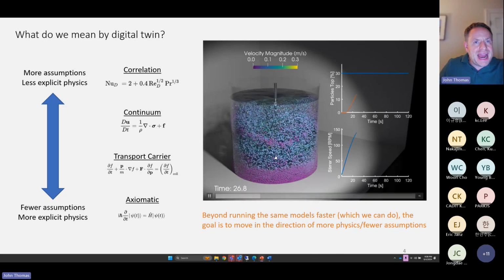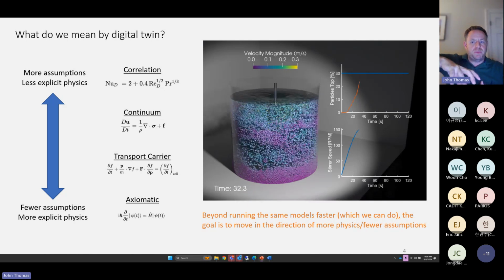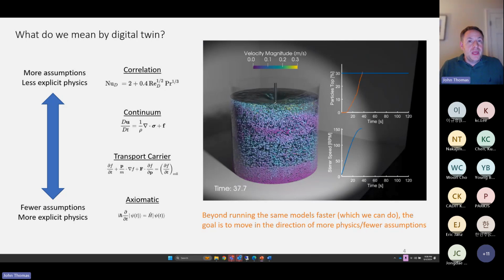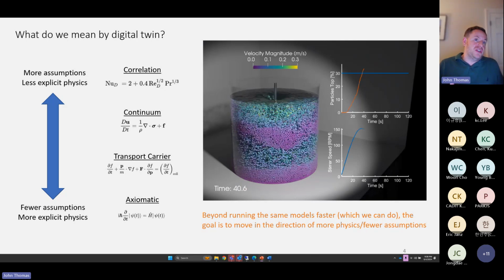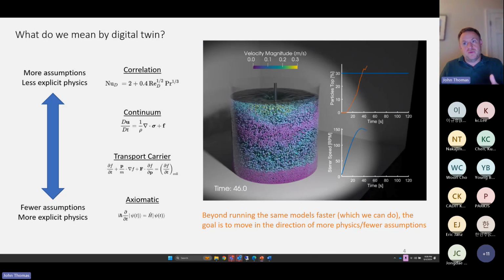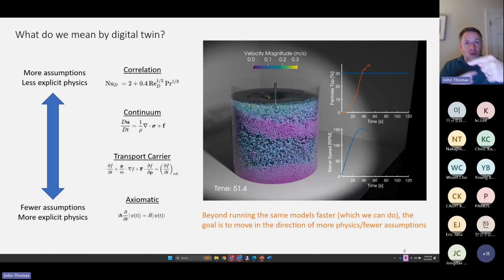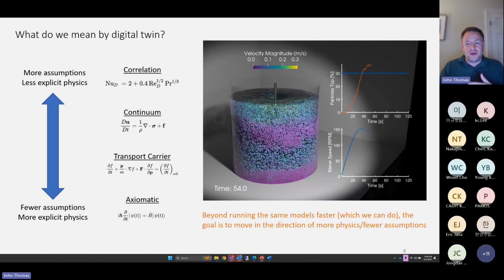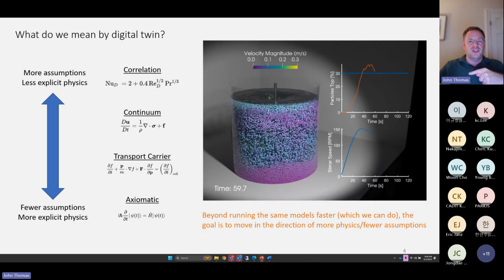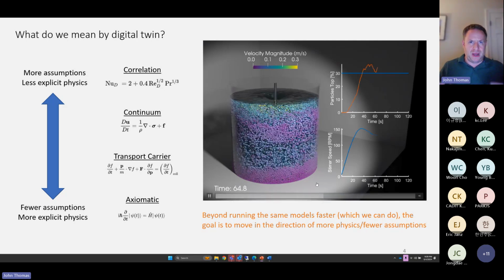Importantly, I have a PID controller embedded in the model that is dynamically adjusting the impeller speed to achieve a target suspension ratio. And this is neat because it's not just a RANS simulation where I'm looking at a snapshot of the flow field. It's not just a DEM simulation where I'm looking at only particle settling, nor is it just a short, brief interval of watching fluid and particles move together. I'm modeling minutes of flow field with inline control, looking at multi-phase simulations and modeling the entire process.